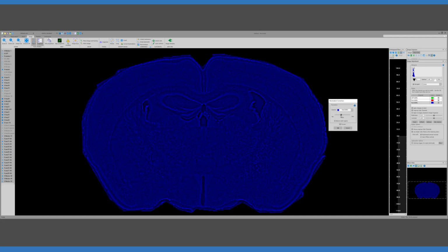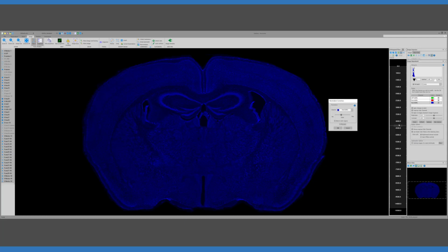I think you're probably hitting Page Up, and that's actually changing the scale in this case. You might want to use the orthogonal view to go here. So what Brian's referring to is that there are multiple ways to maneuver through the stack, and one is using this ortho view function, and I can go to one section or another.